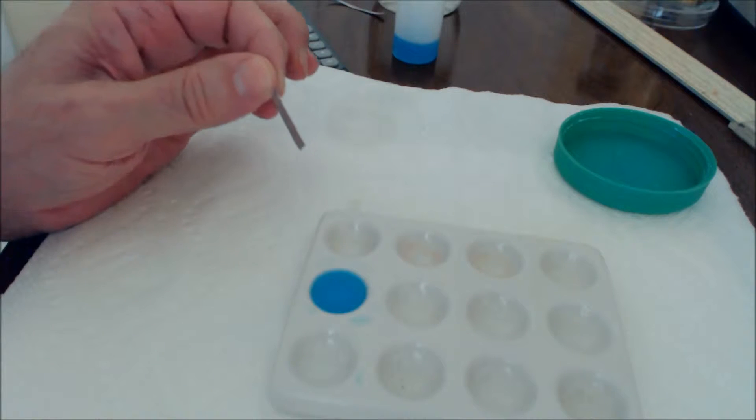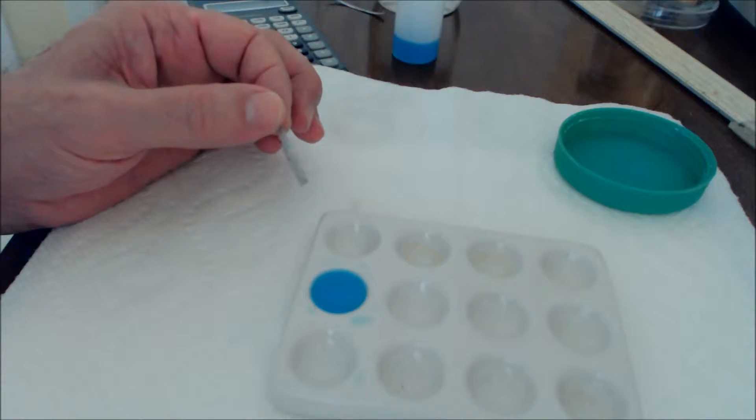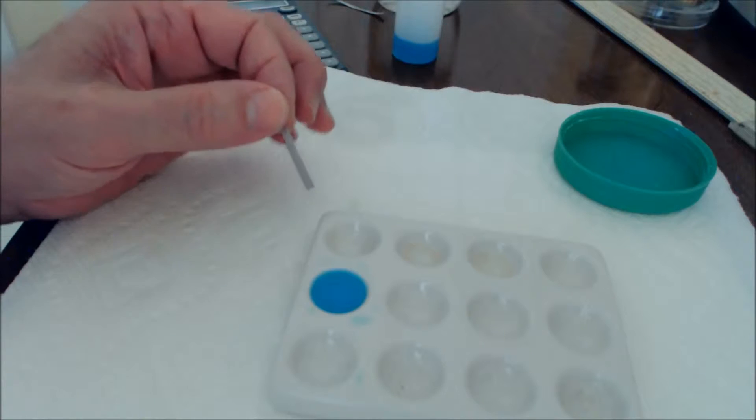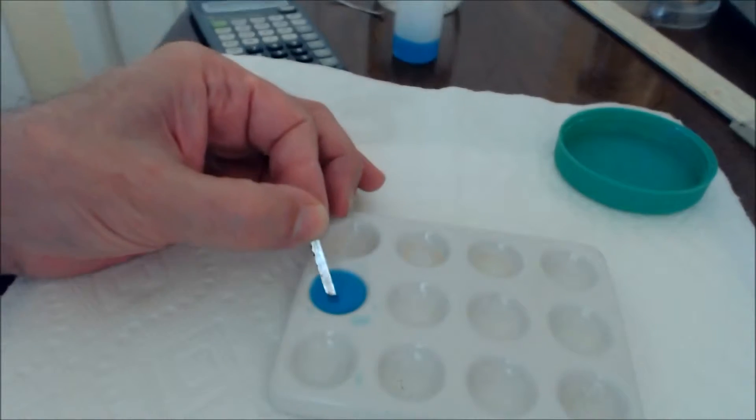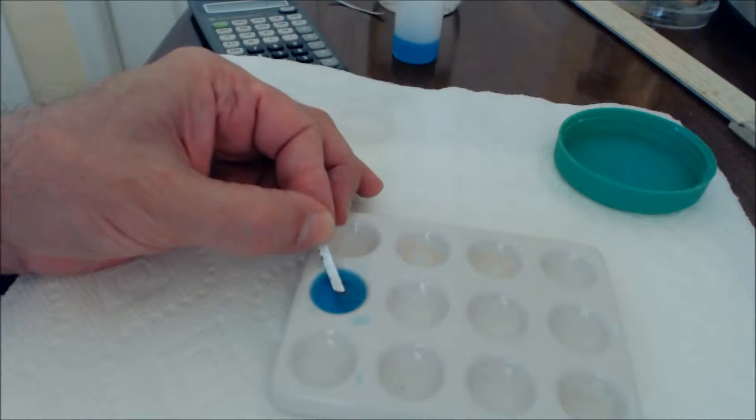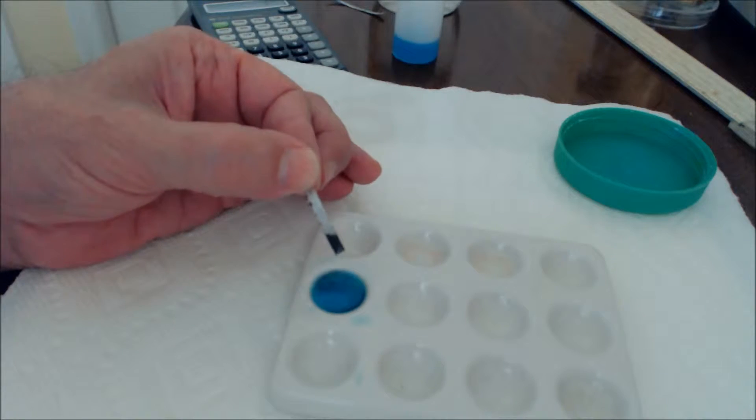The copper is in the plus two oxidation state, copper ions. And I want to just show you that this is a very spontaneous reaction. The copper gets reduced. The magnesium gets oxidized. You can see it's very shiny. And when I put it in here, it becomes dark.